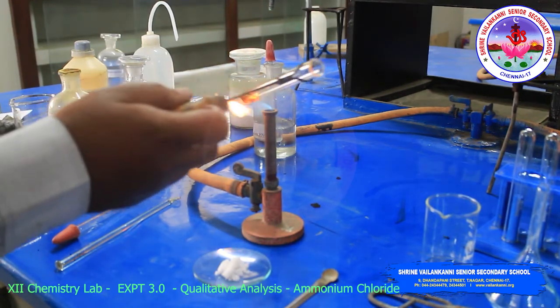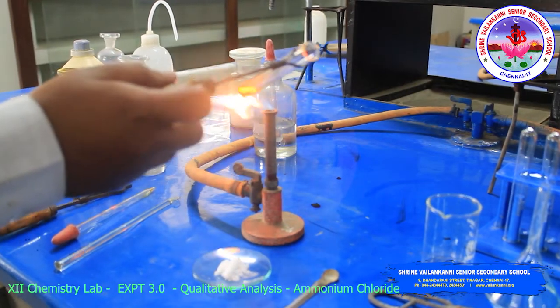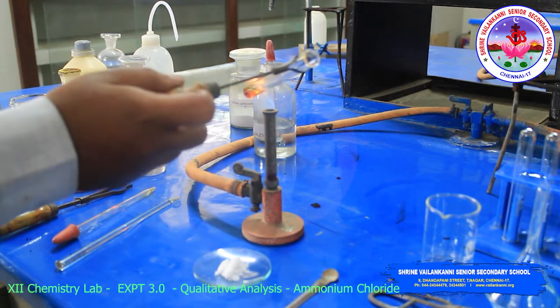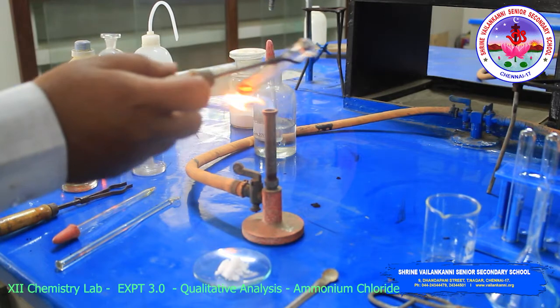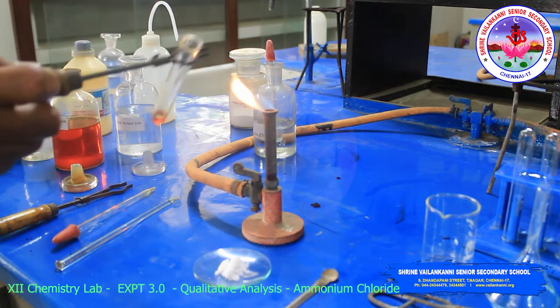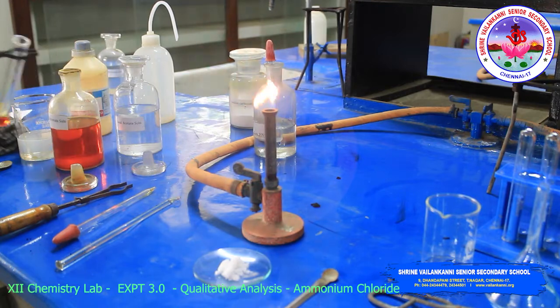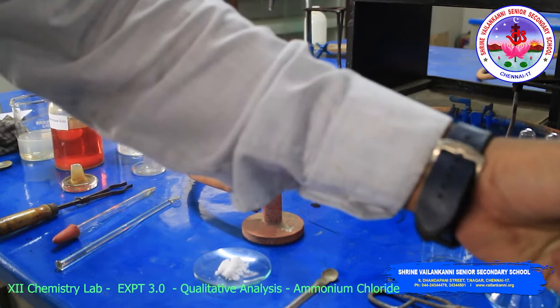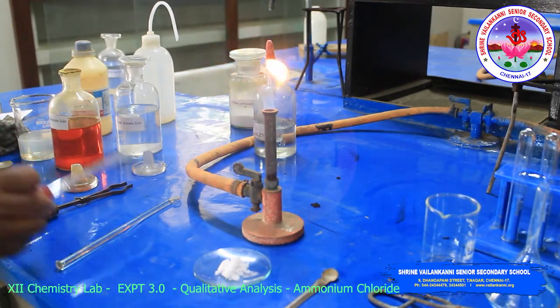Before that, look at these vapors, the red vapors, this indicates the chloride is confirmed. Then you have to pass the red vapors into the sodium hydroxide solution. I will take the sodium hydroxide solution.